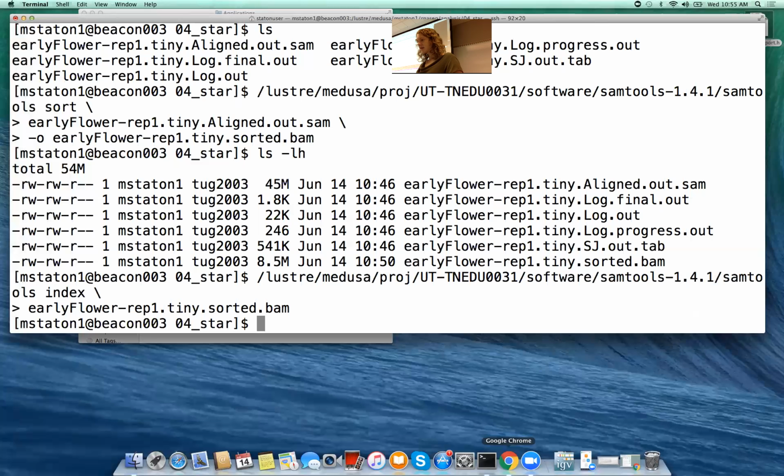Yes, so this is just one sample. You can also keep adding your samples in. Here I have our small file up here, and then our larger file down here. So I'm looking at 2 different lanes, like 2 different samples. The very small file, and then a bigger set of reads that I loaded up. You could load up all 6 samples and look at them next to each other. After about 6, it gets too busy and you can't really see anything.